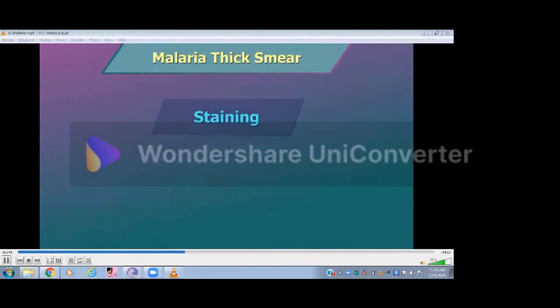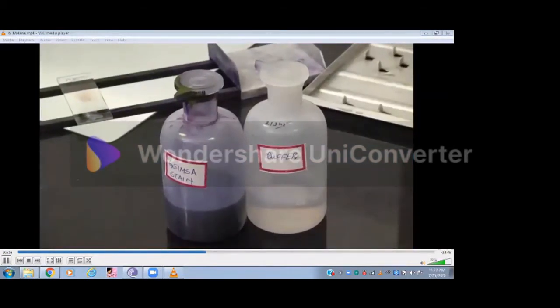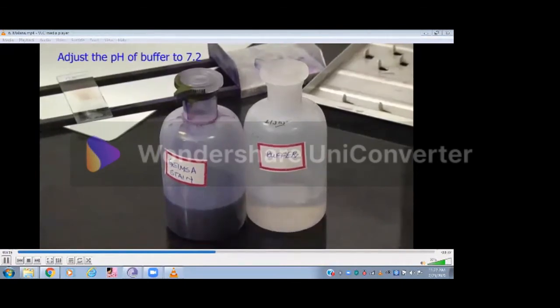Staining. pH should be adjusted to 7.2 for staining for malarial parasite. A number of Romanowsky stains like Field's, Giemsa's, Wright's and Leishman's are suitable for staining the smears. Staining by Giemsa stain will be demonstrated here. If you are preparing your own stain, always prepare it fresh, according to manufacturer's instructions. Adjust the pH to 7.2.